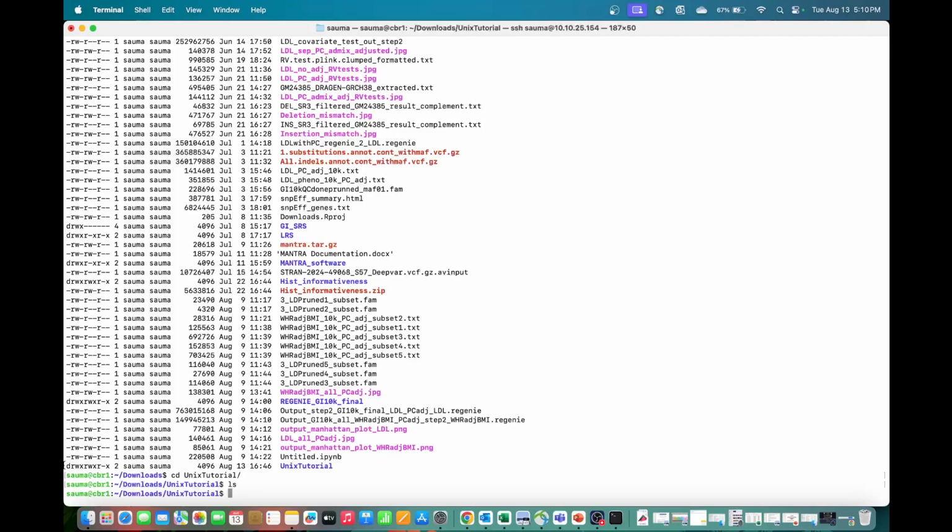Now on the left you see the directory in which you are currently present. In most cases this directory path is too long, so in the Linux system you'll see that it has been shortened a little bit. So you cannot actually tell from this line where you are, in which folder compared to your home folder, in your directory.